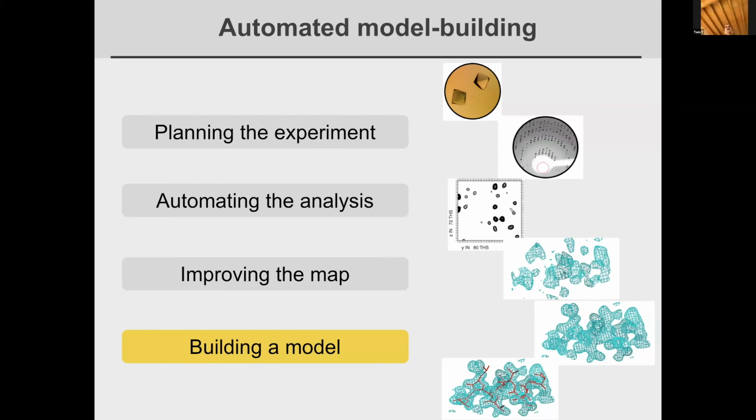Yeah, so how do you know basically if it worked? What you're going to look at is the next level to determine whether the previous level worked. So if you can build a model, then you probably got the sites right. It's very difficult to be really confident about whether you got the sites right if you don't do anything after that. If you don't look at a map, if you don't build a model, it's hard to be sure.